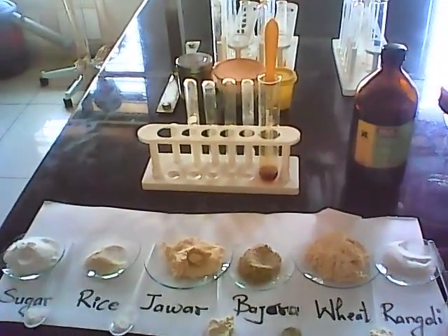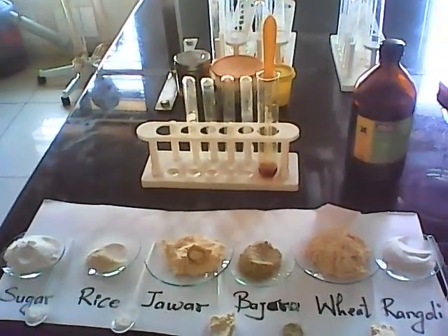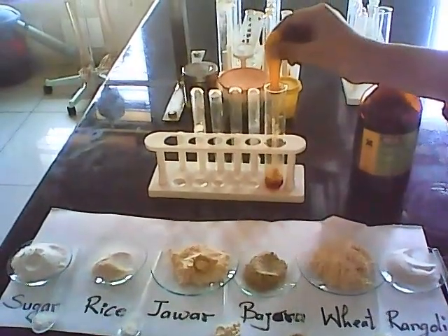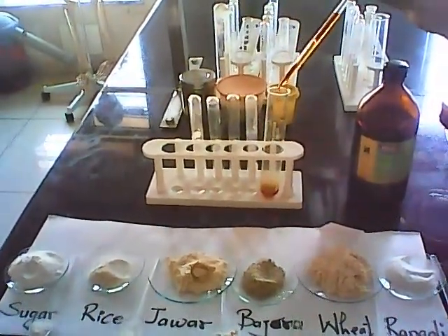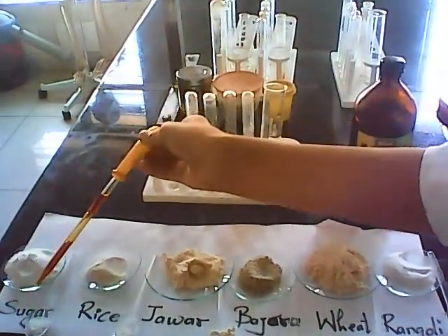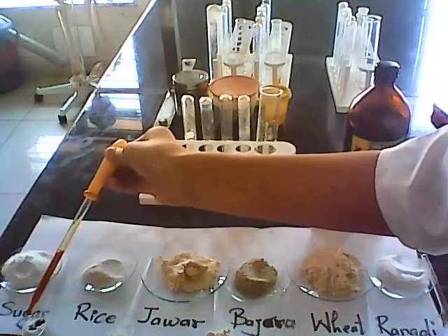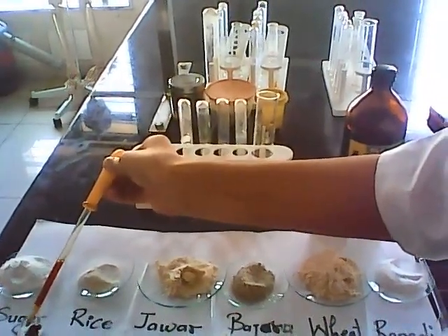We will check whether the samples have carbohydrate in them. We will now take the iodine solution in a dropper and put it on the spoon of sugar. We will check whether there is some change in the color of the sugar or not.